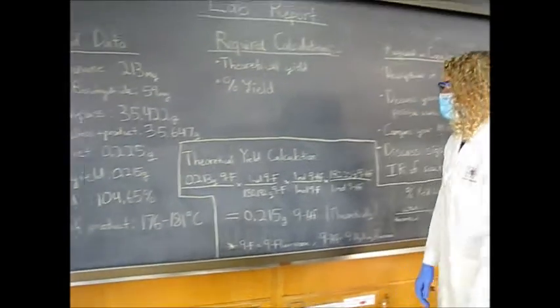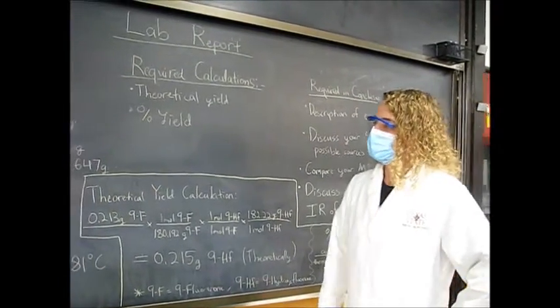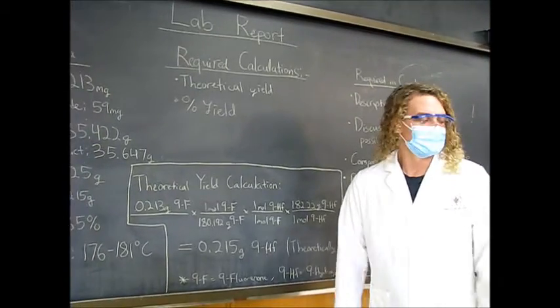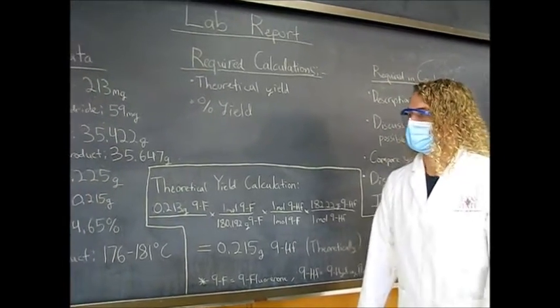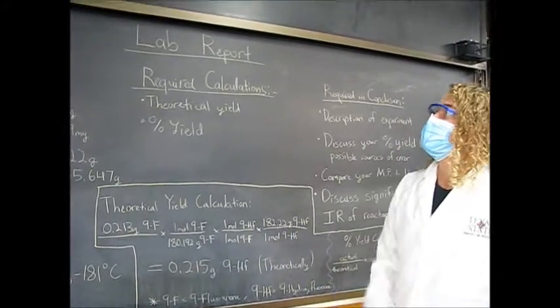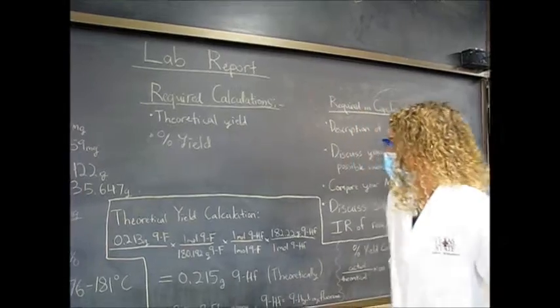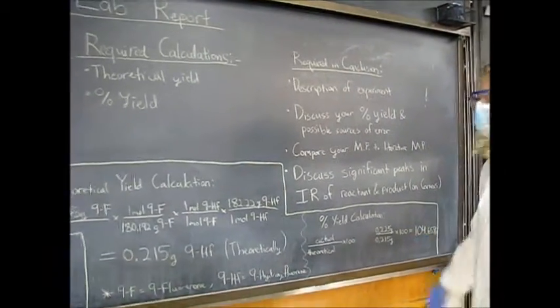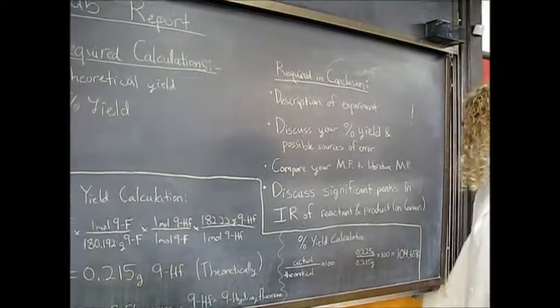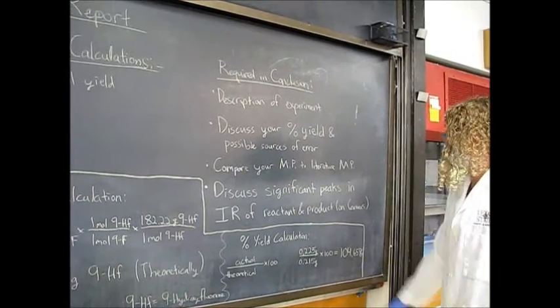Probably what happened here that caused the percent yield to be high is we could have not left it in the oven long enough, so there could still be excess liquid in the product. Another thing, like I mentioned, there was still unreacted 9-fluorenone in the product, so that might also be contributing some weight to the overall product. Both of those things could contribute to the high yield.